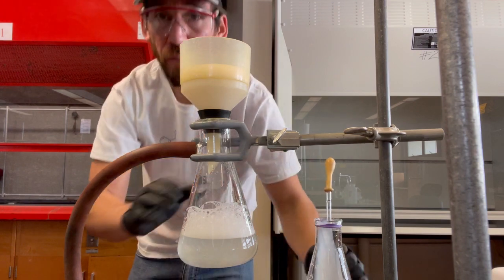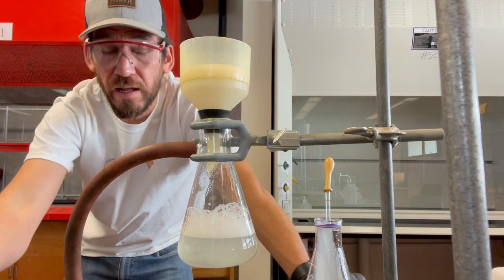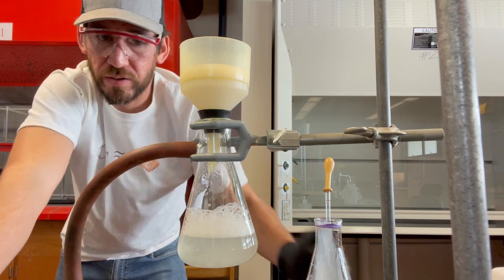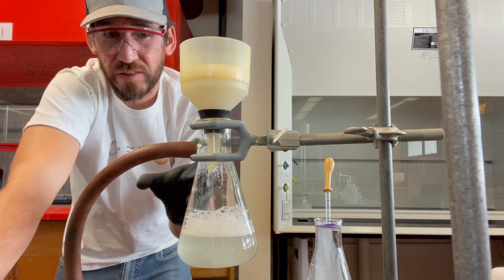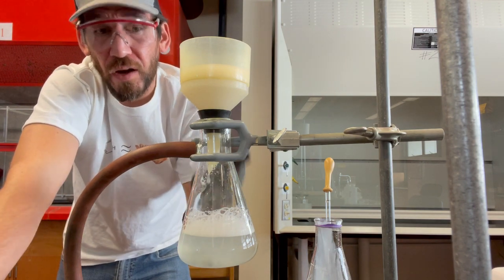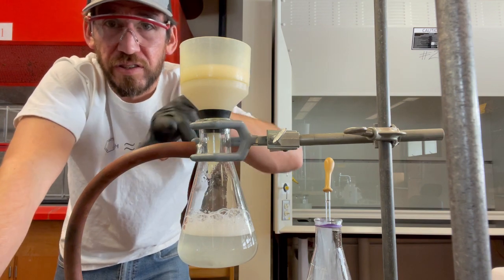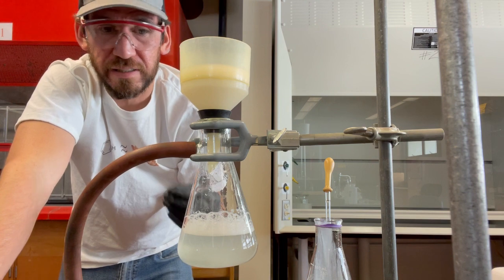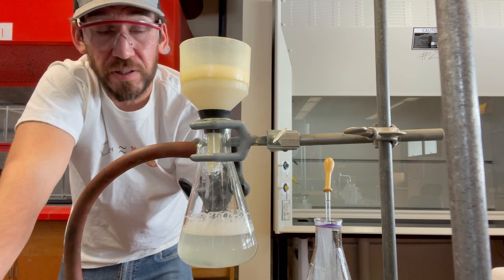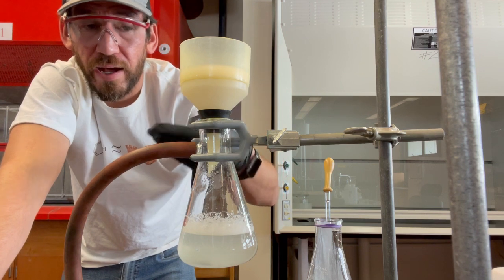So you want to slowly pour it because you don't want those bubbles to quickly go up inside of the vacuum line. But you also want to slowly pour it so you can have the clean solution that doesn't have any sediment go through first, so that way the filtration process goes a lot faster. Because as you can see, the bottom of that had a ton of yeastiness, and that yeast solid material is kind of clogging the filter, and it's taking a while.